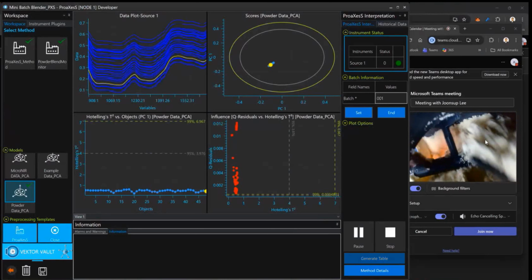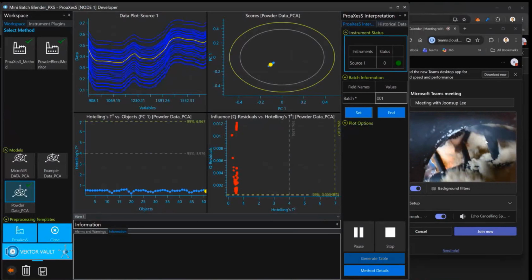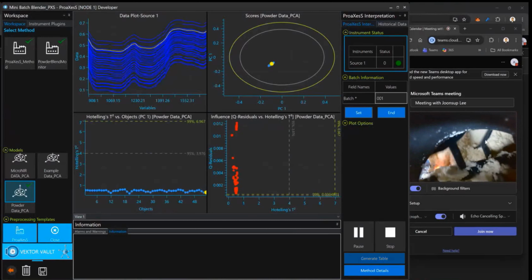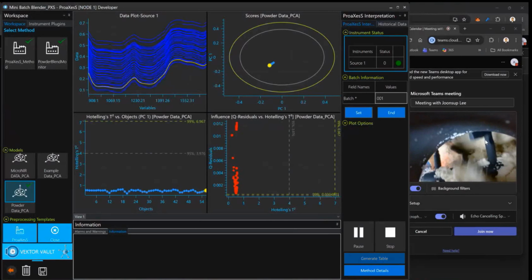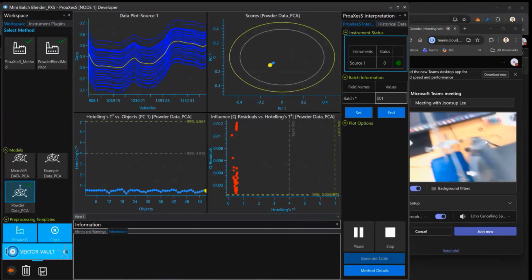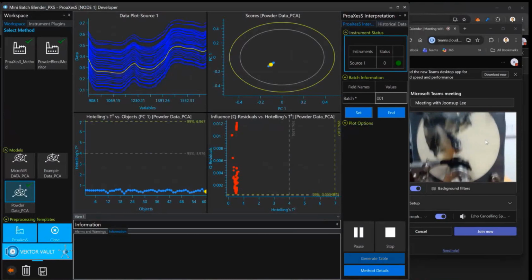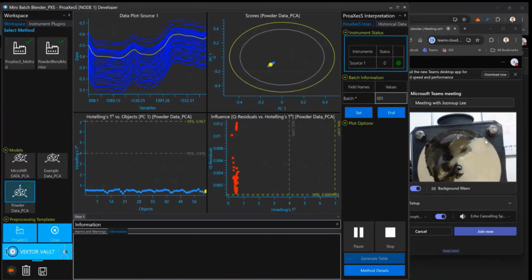But as you can see from that video before, right, you can see maybe hopefully that there's the NIR light, and you see that it's not always covered. You're getting different parts of powder falling onto that. So let's now put some rice flour in and see what happens.